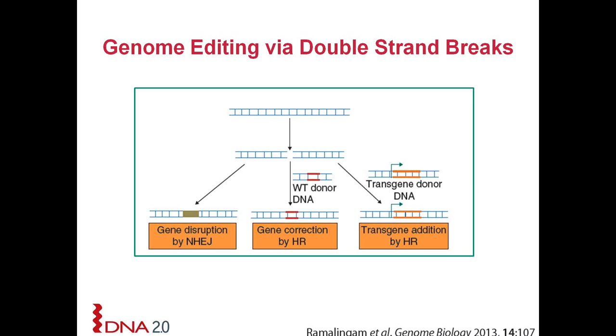Great. Another question is on selecting, which is how do you select for knockouts? Can you select positive cells with CRISPR by using antibiotics?